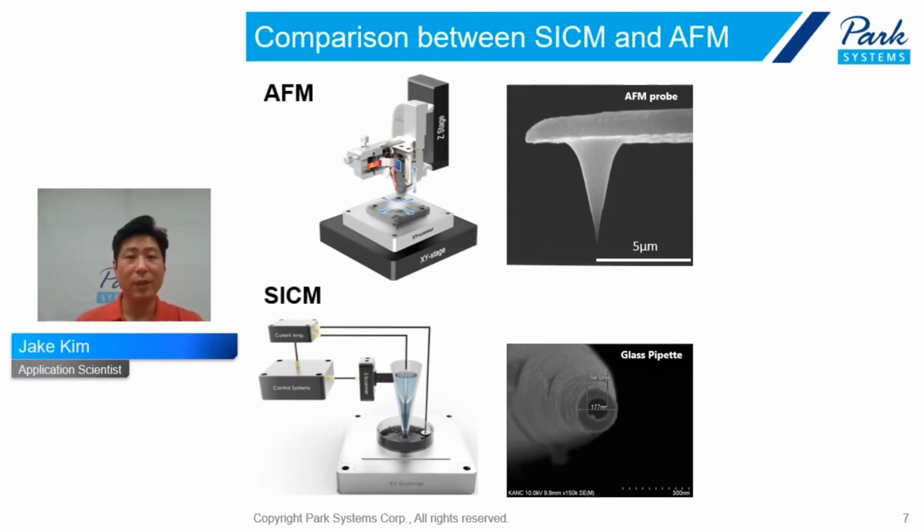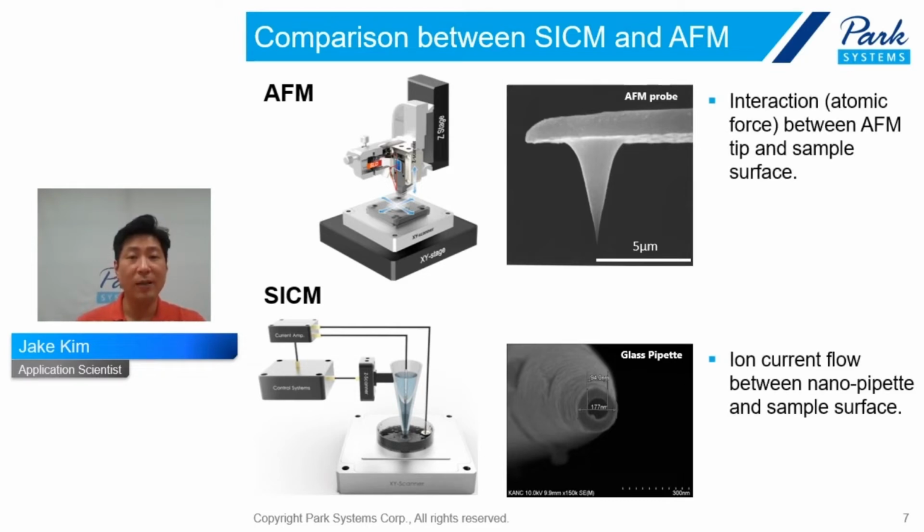For the feedback system, the atomic force between the AFM tip and sample surface is utilized for AFM imaging, but in SICM, the ion current flow between the nanopipette and sample surface is used.